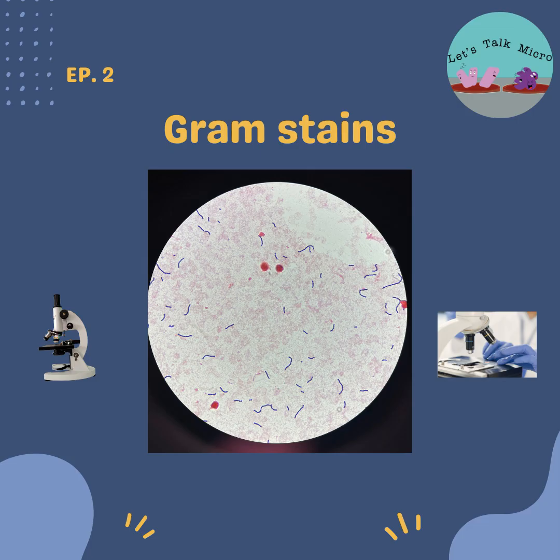So you place that slide on a slide warmer for 10 minutes. And this is just you fixing your organisms to the slide. There are two methods that you do this. A lot of facilities heat fix them, which is you place it on the warmer, like I mentioned, for 10 minutes. Other facilities, sometimes smaller labs, will just fix it by adding some methanol and then do the procedure. So once your slide is ready, either fixed by methanol or heat fixed, you remove it and place it on your staining rack.